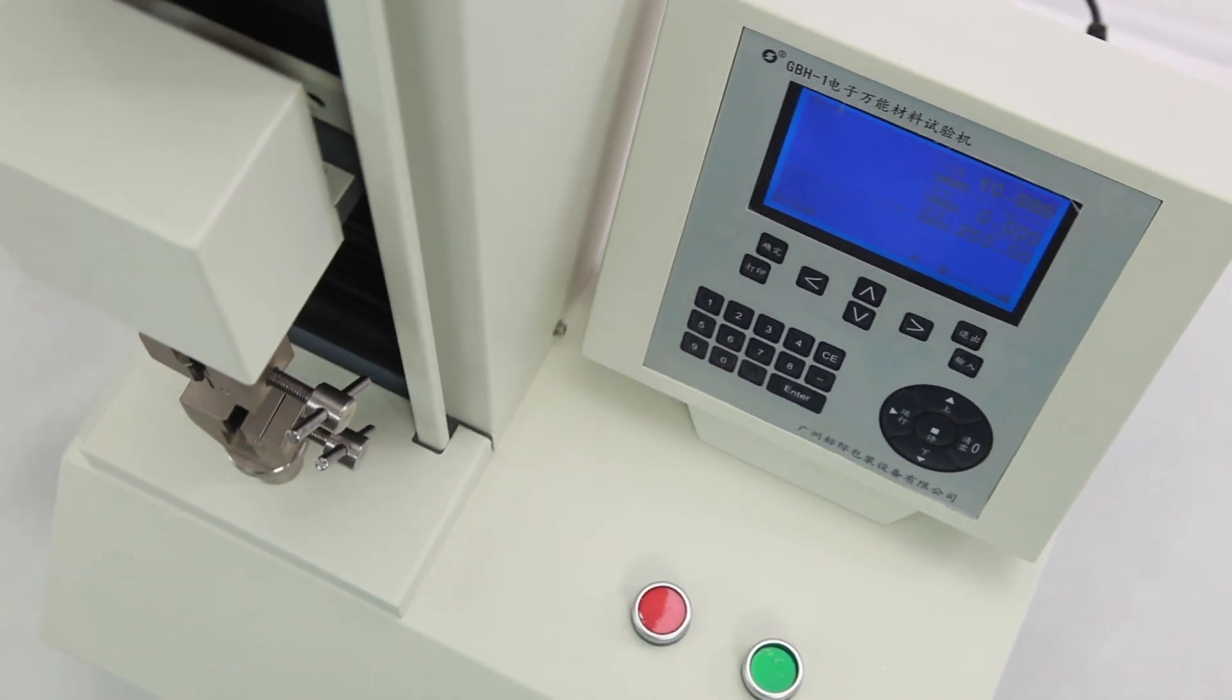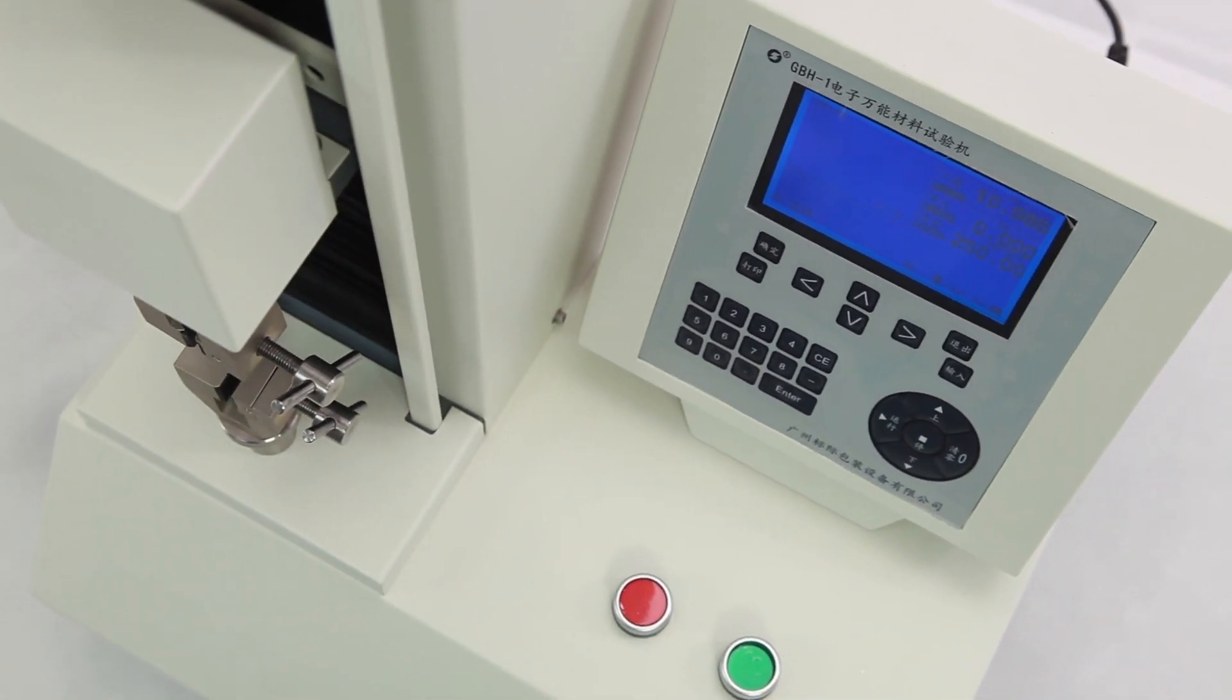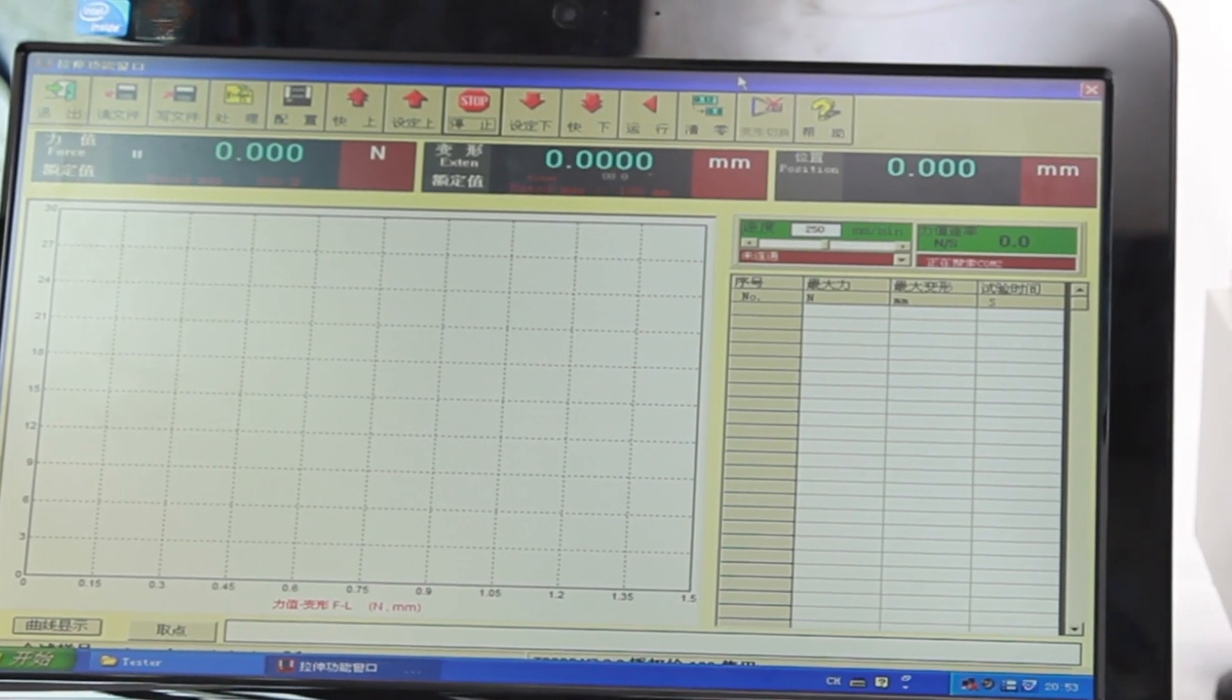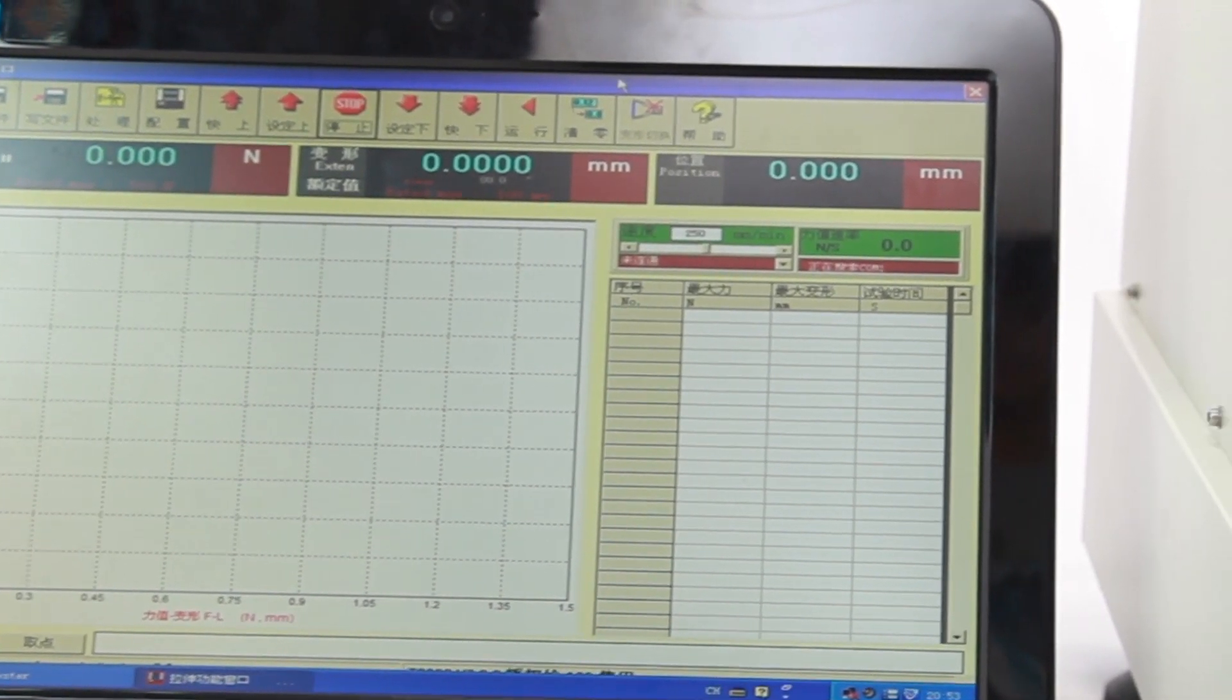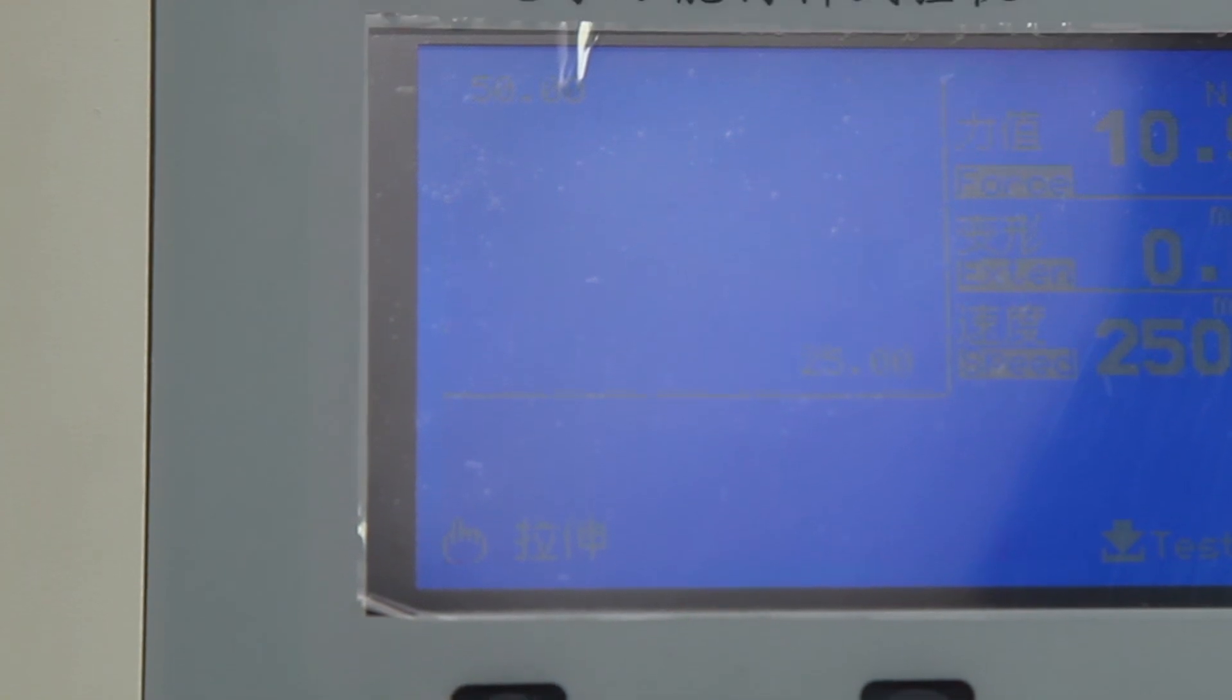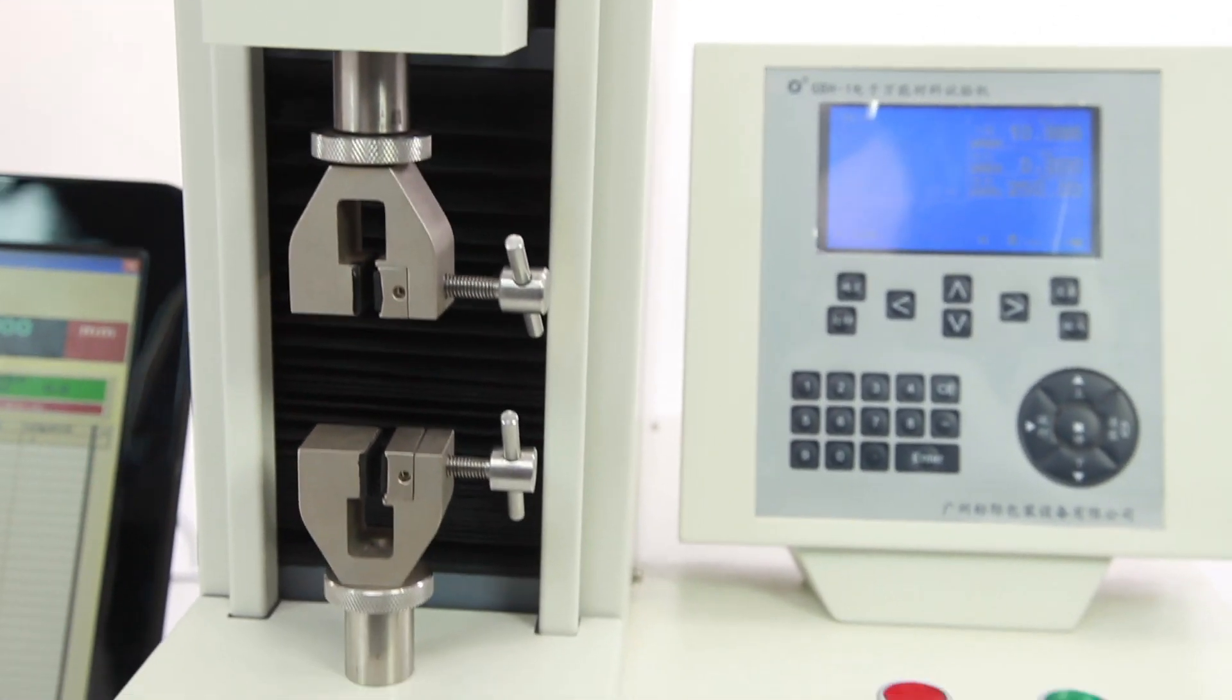It features a versatile user interface in control mode. Users can set parameters of speed, thickness, width and so on.